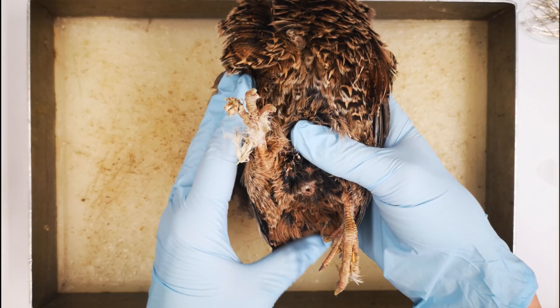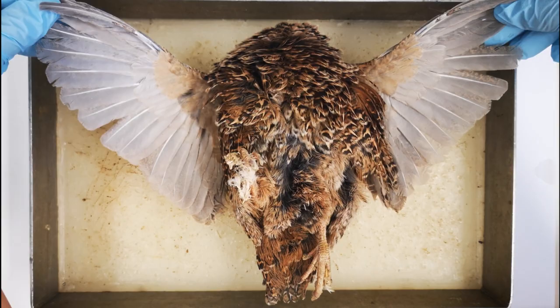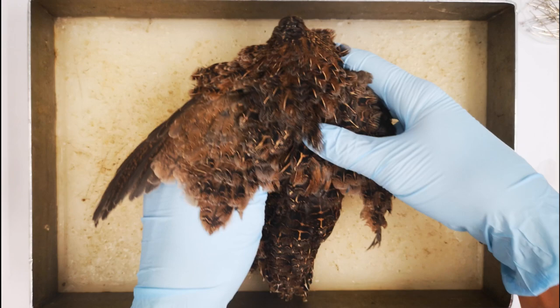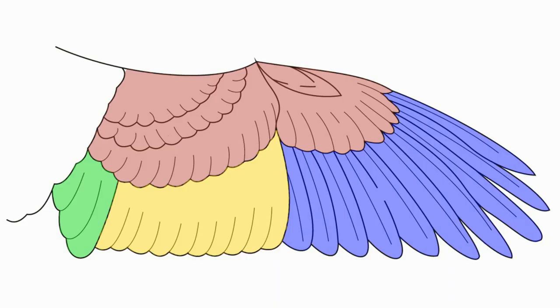The opening of the cloaca is clearly visible from the outside. The feathers of the wing have specific names. The wing is divided into two sections, proximal and distal, to the bend of the wrist. On the proximal portion, the small anterior feathers are coverts, and the long trailing edge feathers are secondaries, with some very proximal feathers being tertials.